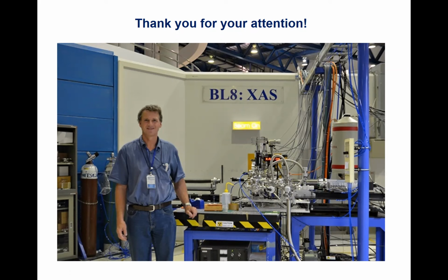So that can be quite helpful. That's my first comment. The second one is relating to your puzzle at the end. I might just comment that having many reference samples or too many references doesn't necessarily help, especially if you're in the XANES region.